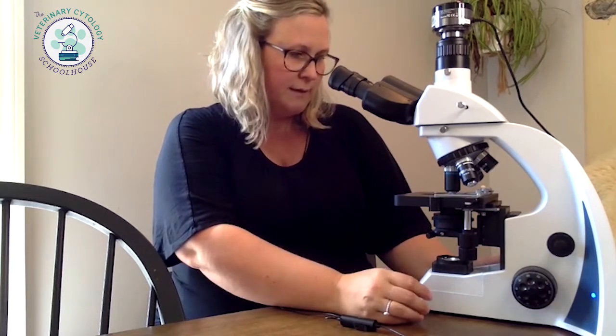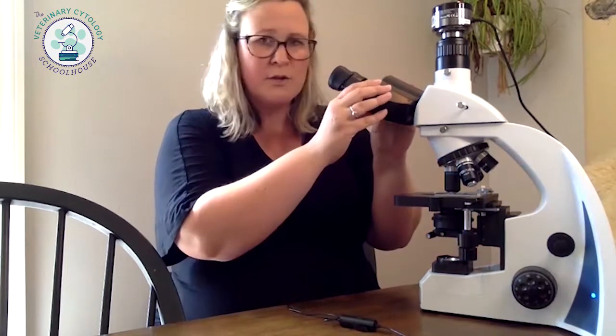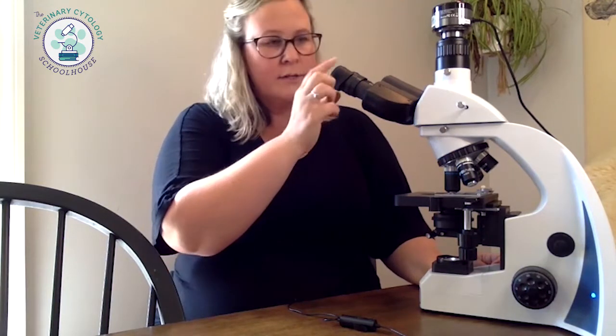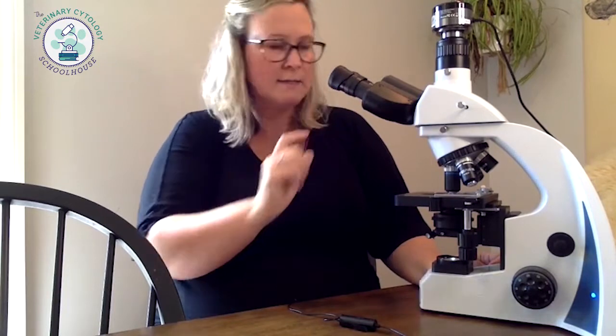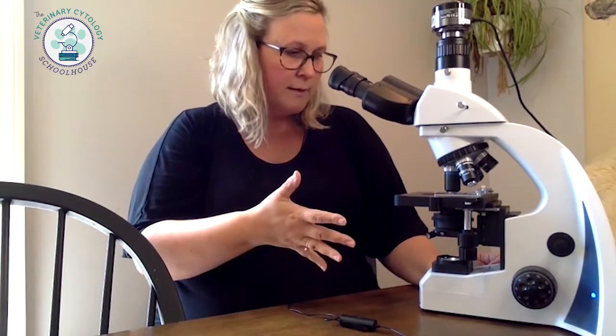Ergonomically it feels good to use — it's not hard on your wrists and it has a nice flow; it's just not awkward or clunky. You can also adjust the oculars to your different eye widths for different people in your clinic. The stage is really smooth — when I'm moving it around it's not jittering or getting caught; it's really nice and smooth. And the oculars are really wide, which is nice because in cheaper microscopes they're just like tiny pinholes. These are wide and they have rubber eye guards, which is great for comfort and cleanliness.